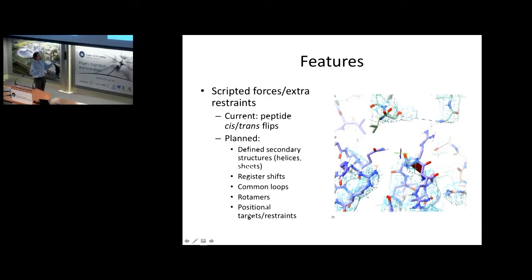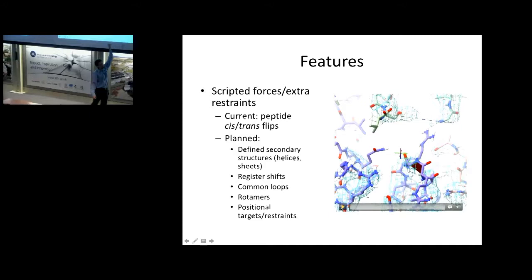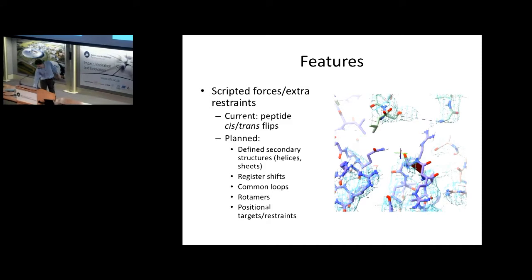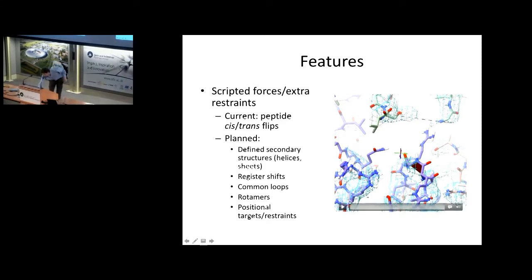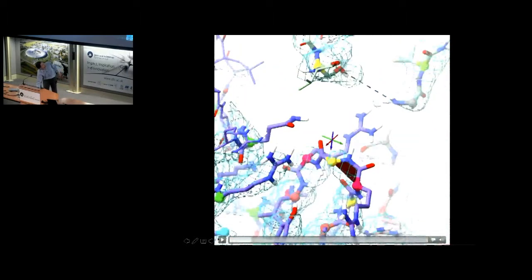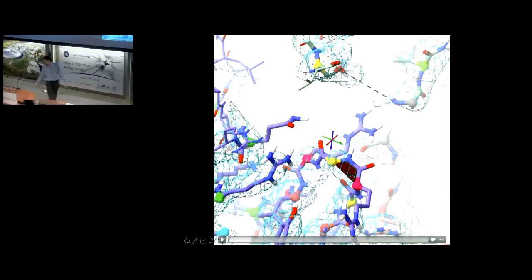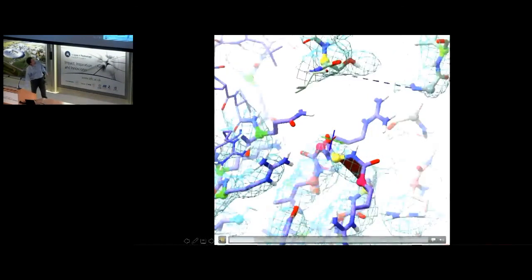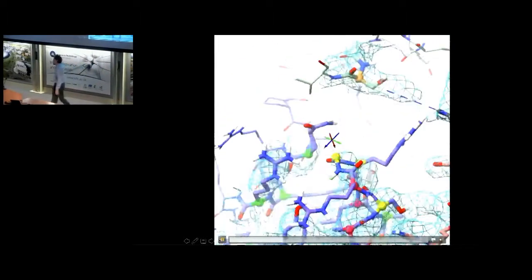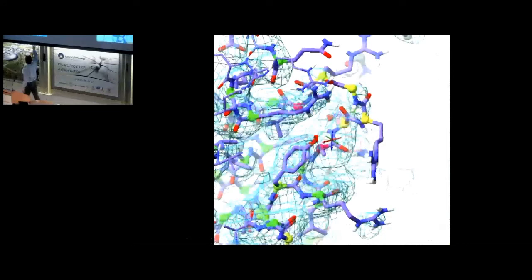But to fix this, this is a sort of thing that should be trivial and I want to make trivial. So here, for example, I have a table that will list all of these. You click it, it'll take you to there and select that residue. Click one button, it will start a new simulation around that area, which takes a few seconds to do. Then pause that, select one of the atoms in that cis-peptide bond, and click a button and blink and you'll miss it. It's now trans.